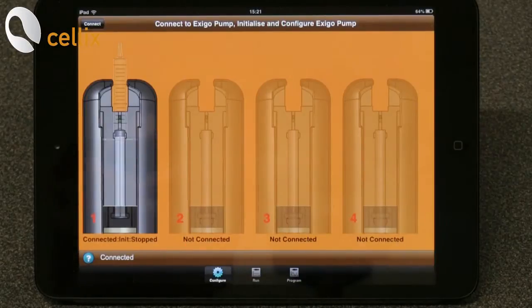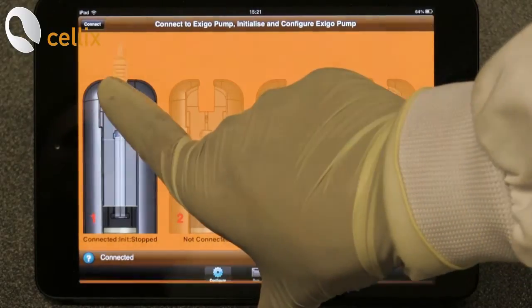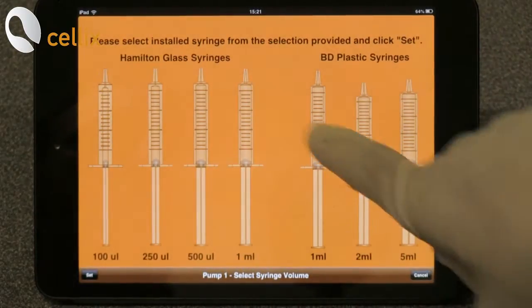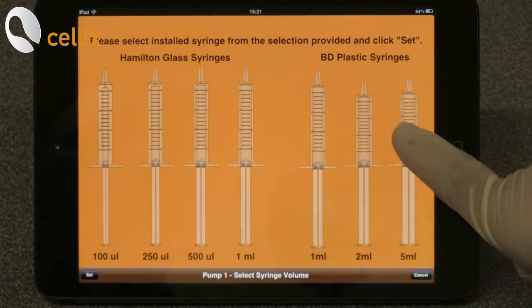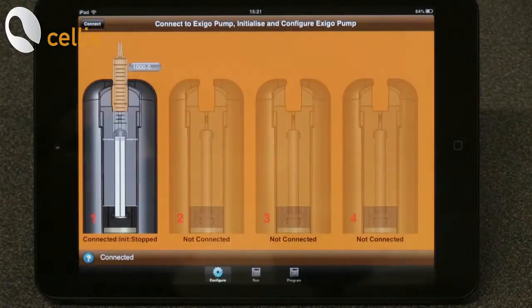Next is to select the syringe. For that you double click the syringe. You have options for the glass syringe and the plastic syringe. Click the 1ml plastic syringe and set.